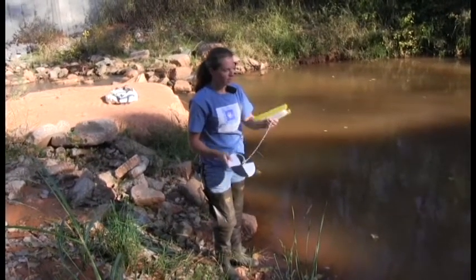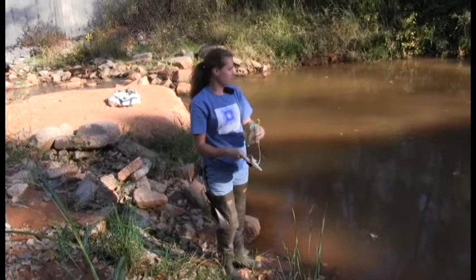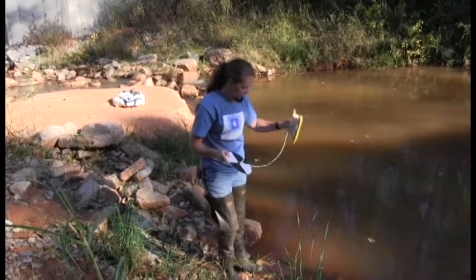Usually we have our back to the sun. We try to enter the creek downstream of where we're going to be monitoring, but usually in a pool the water's not going to be moving anyway. So we're trying not to disturb the sediment and get a true secchi depth reading.